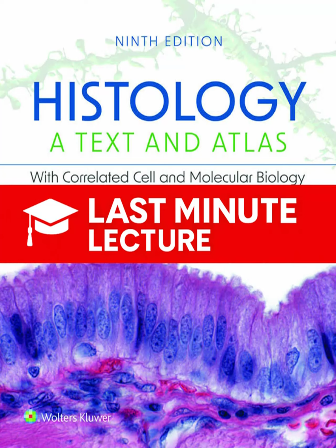All right, moving into phase 2, we're shifting our focus a bit. We're going beyond that general architectural staining and into these highly specific chemical procedures, histochemistry and cytochemistry. Right. These are the techniques that give us functional and compositional information about specific macromolecules inside the cell. And the first major one is the periodic acid Schiff reaction, or PAS. This is our main tool for seeing carbohydrates, right? It is. The PAS reaction stains carbohydrates and carbohydrate-rich macromolecules a very distinctive magenta color.